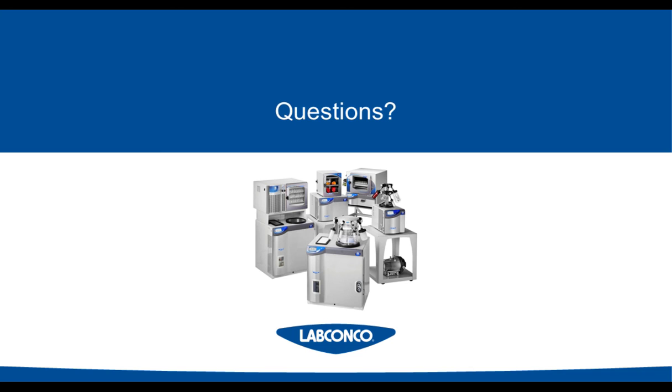If this is just meant as a sample prep step for you in a series of testing, then you could use something like flask freeze drying or trays. But anything that's just going to allow that vacuum to flow freely. So something like a plastic bag, unless it's sitting open, you may not get that vapor transfer that you would if you were using a material that had a permeable membrane. So just something to keep in mind when you're selecting sample containers.